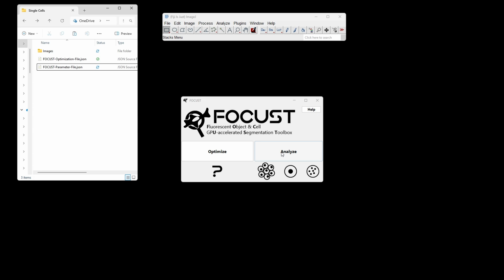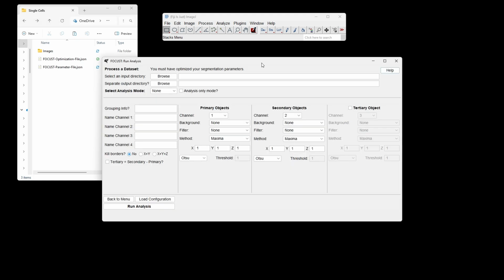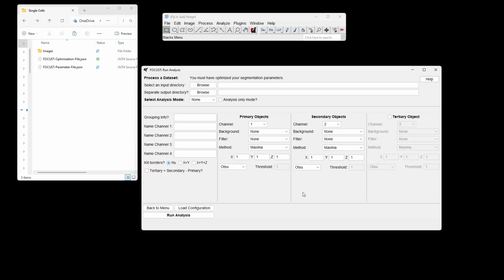So if we open up our Analyze window again, say that I have come back after the Christmas break or the holiday season, and I've just generated some new data, which we will hypothetically say I've added into a new folder here. And I would like to rerun that analysis on this new data so I can continue to build my sort of master data sheet.